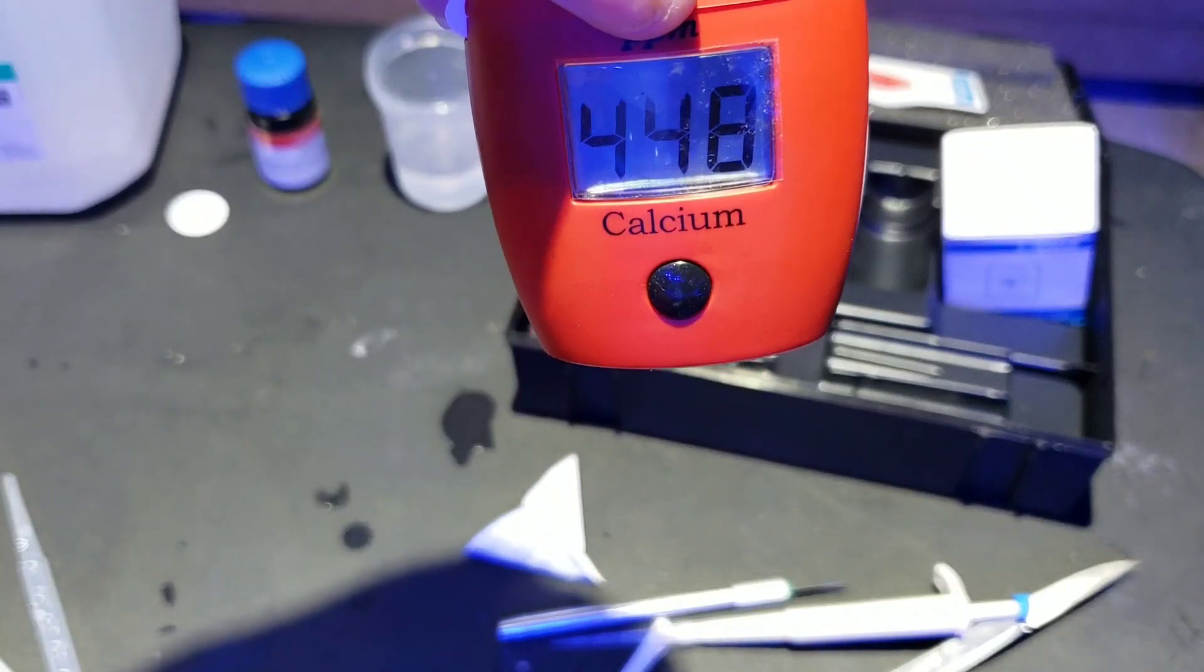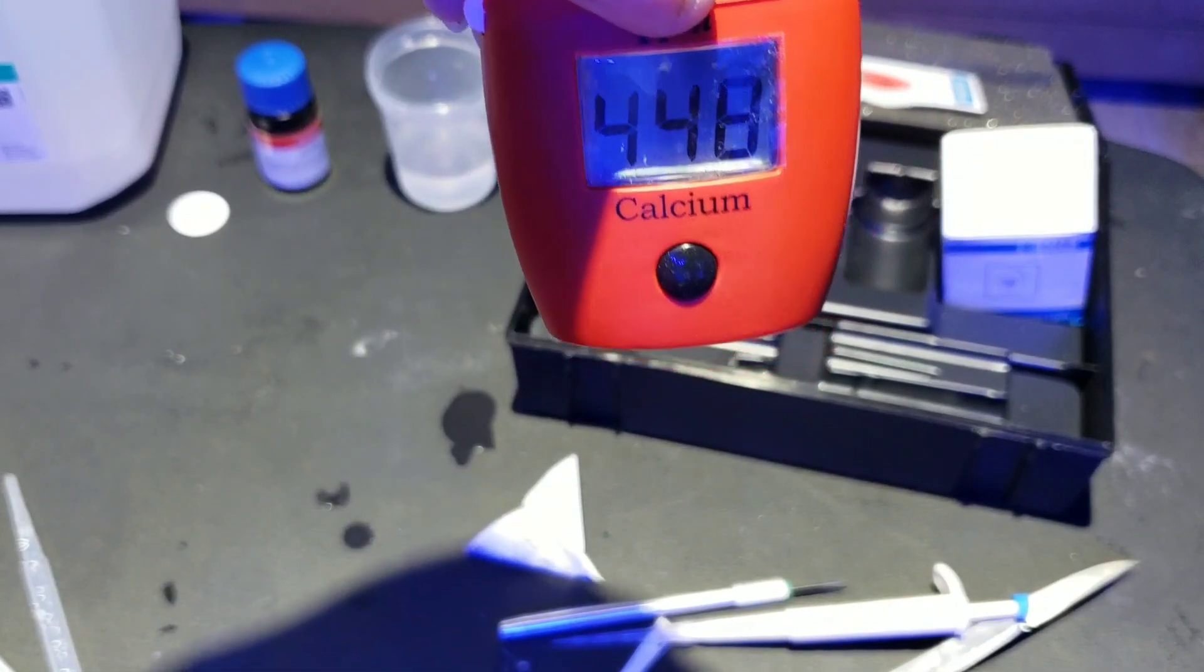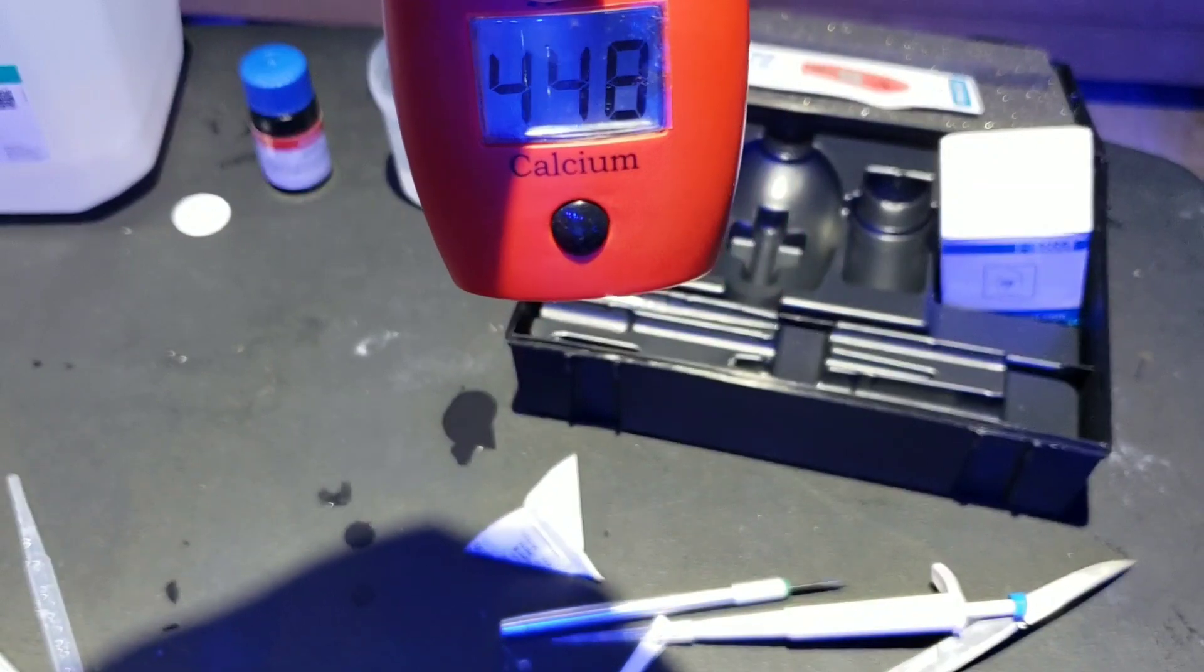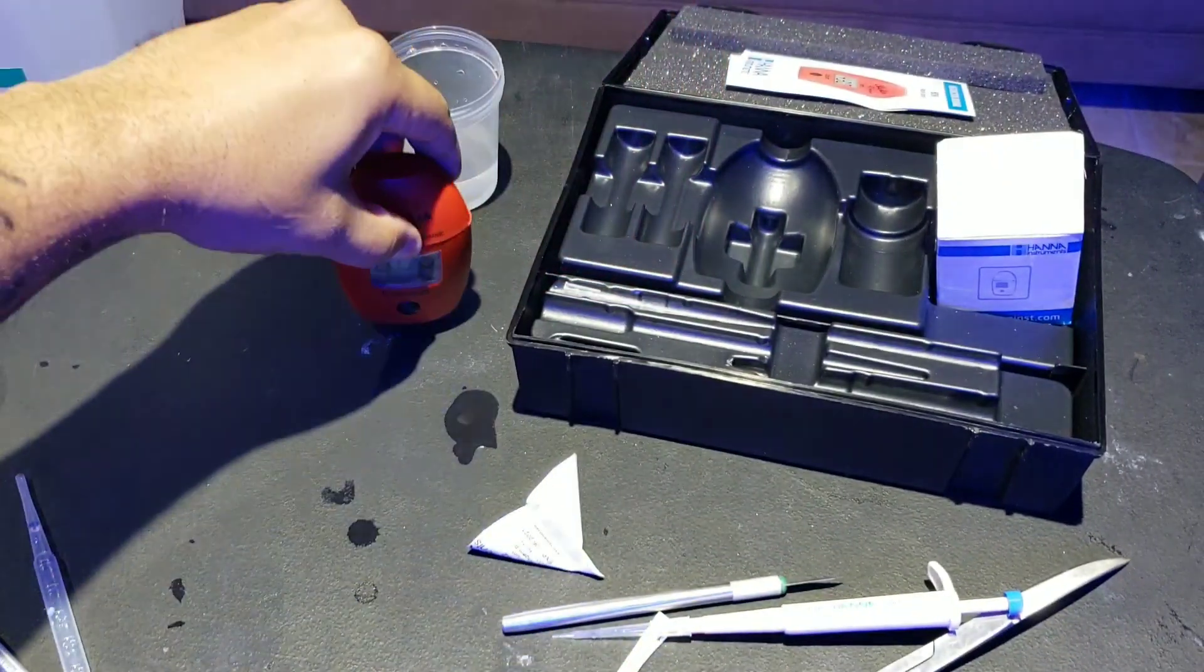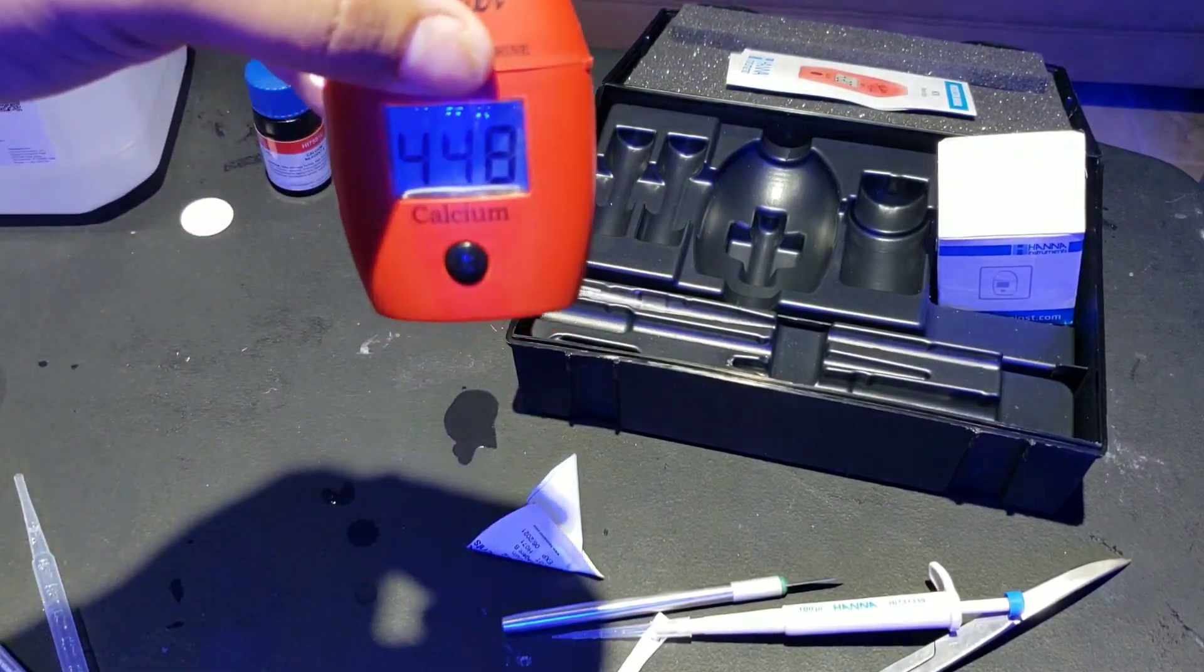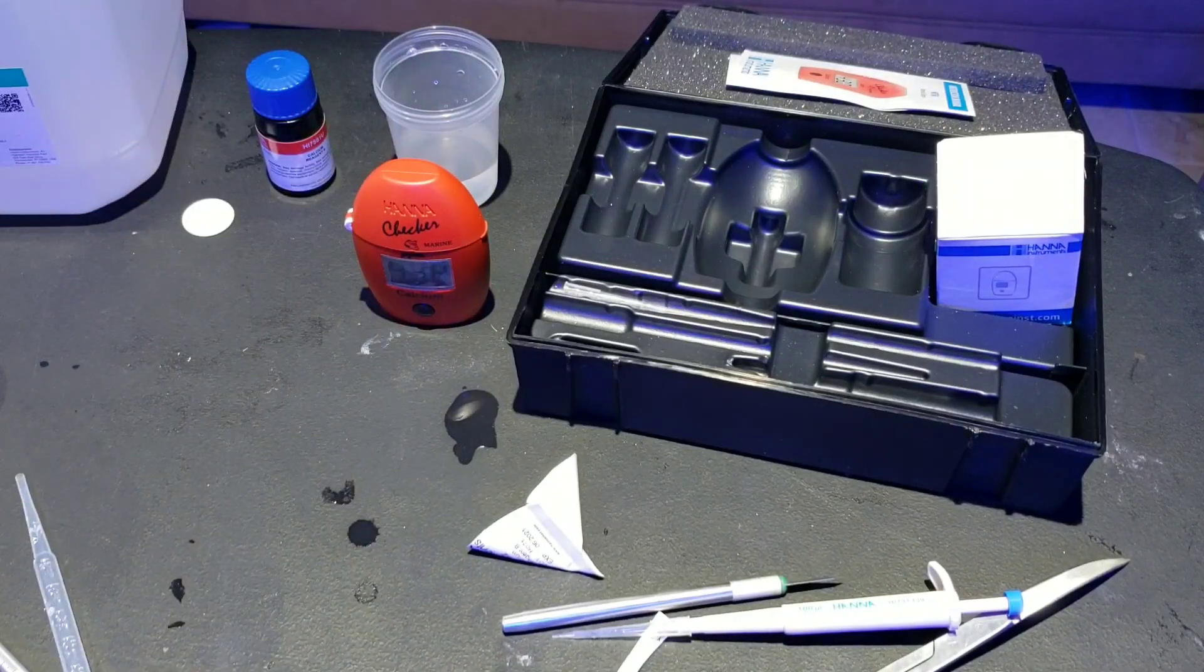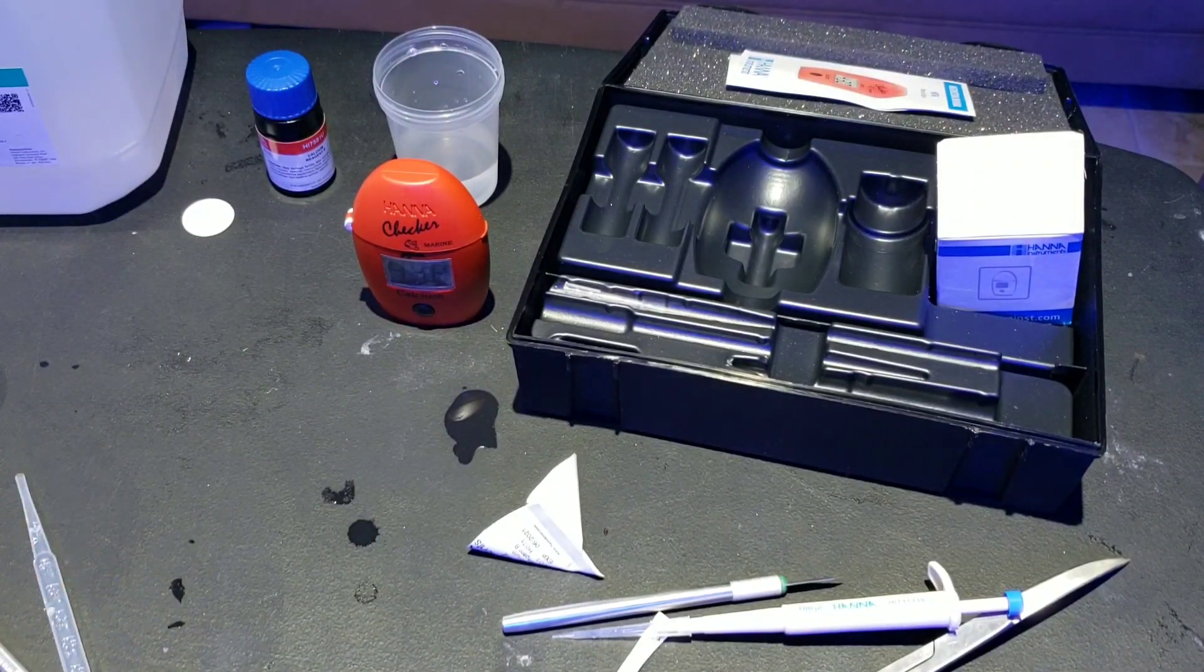Alright everyone. That is the proper way to do the testing. We got 480. Now, once this happened, I double checked this and I had 490. So this is the proper way of using the Hanna checker.